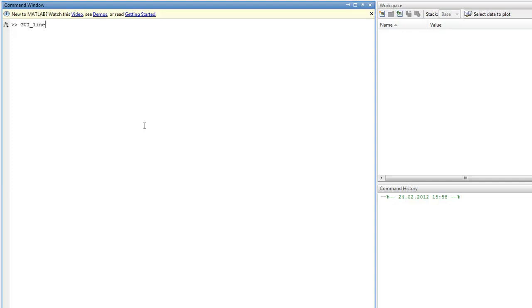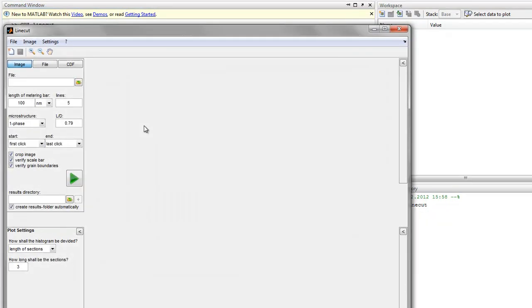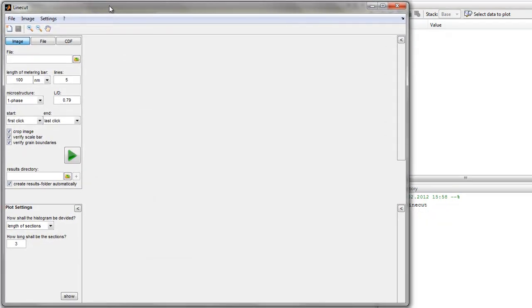First of all, be sure that the whole folder is in your MATLAB search path. Here's the program. On the left side you have all the settings when you want to analyze the grain size of an image.